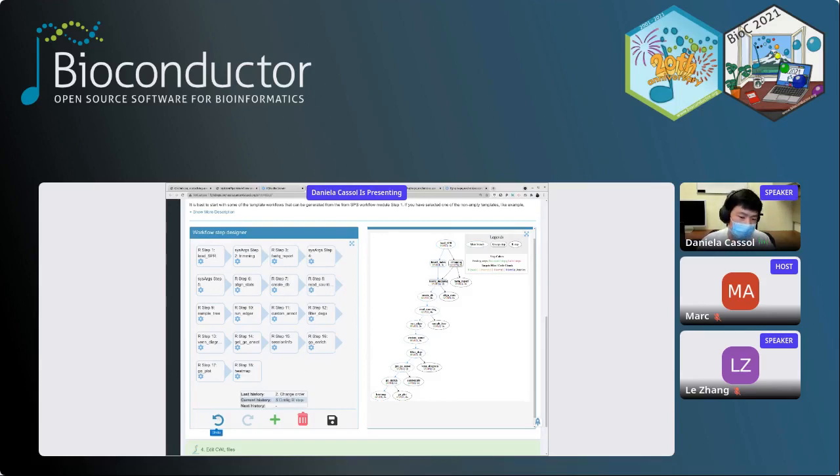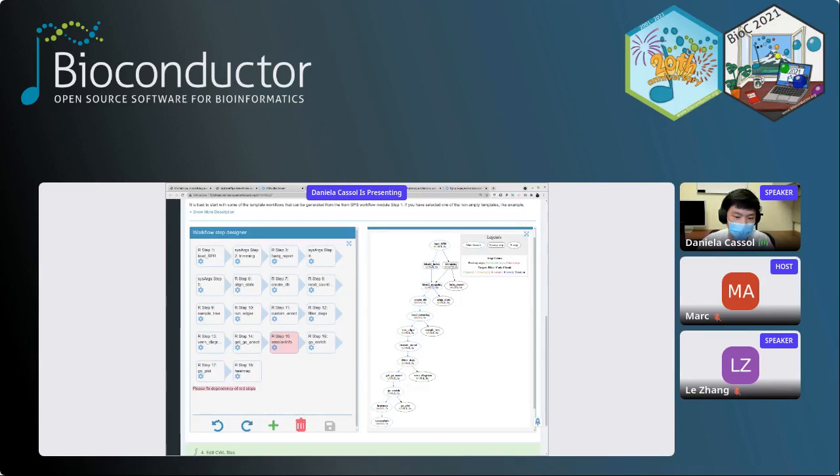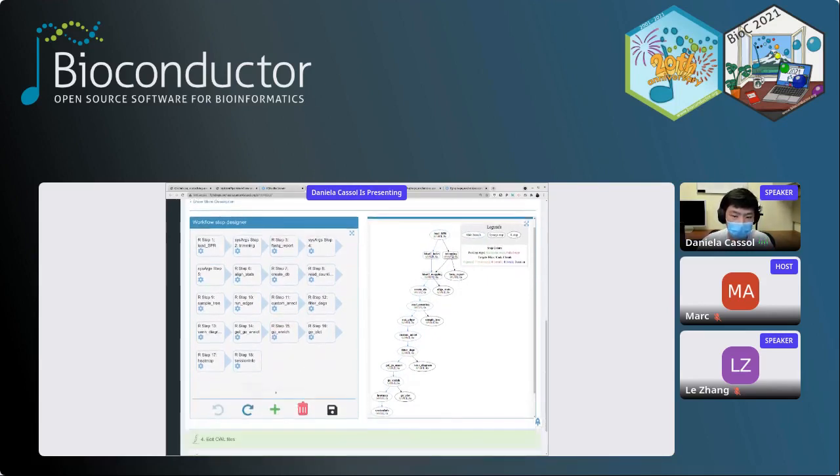Then you can always regret and say, oh, I did something wrong. I just go back one step, go back two steps. This is the initial state we have.